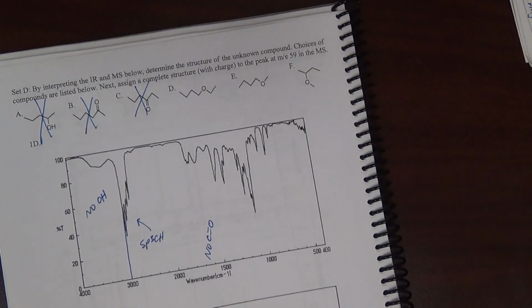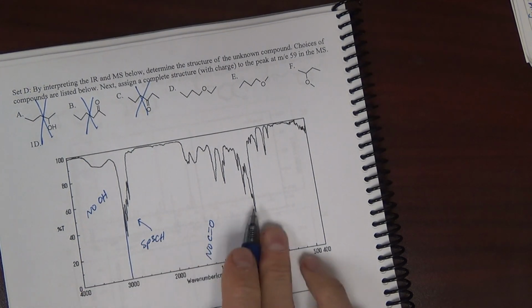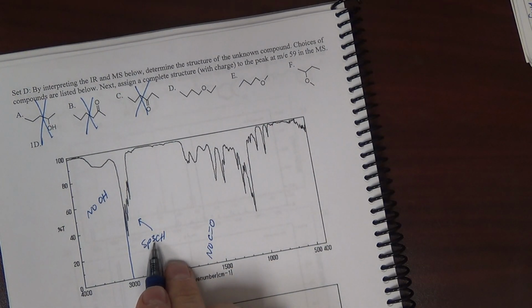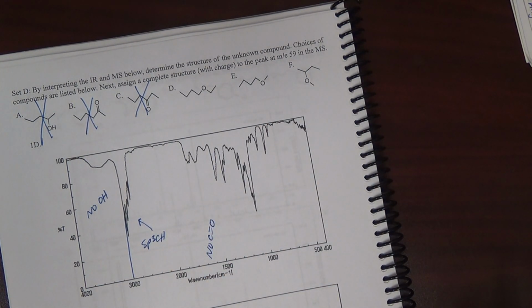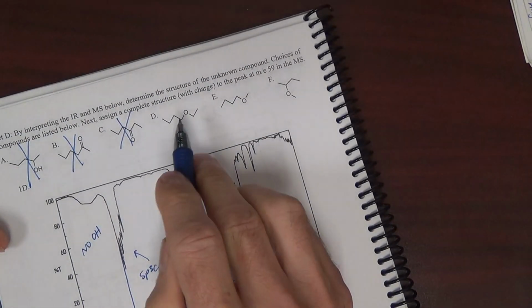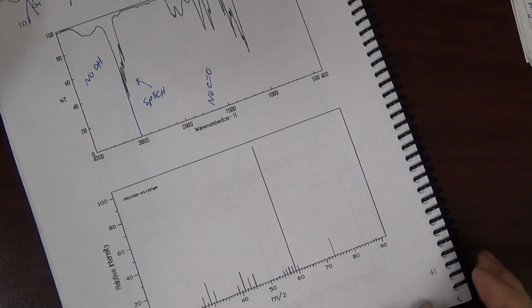The remainder are ethers. It's reasonable. This IR could match any one of these remaining ethers, yes. sp3 C-H. The rest is just fingerprint peaks. Ultimately, from that point, it just boils down to which ether is it. We're going to have to look at the mass spec to determine that.